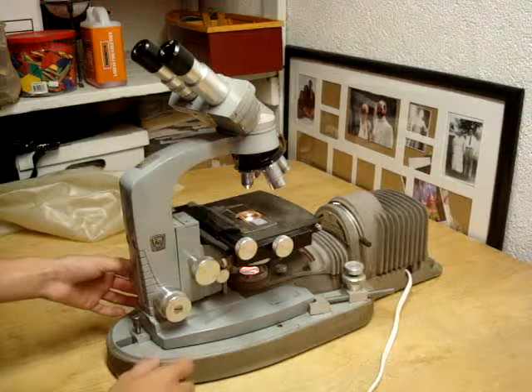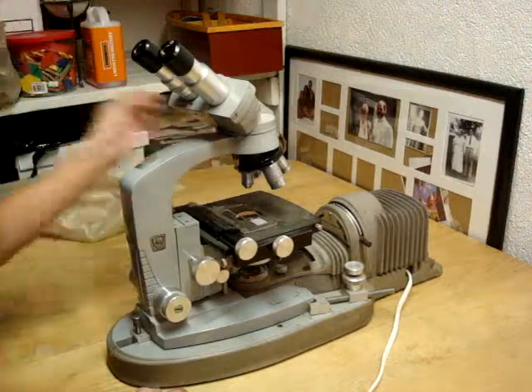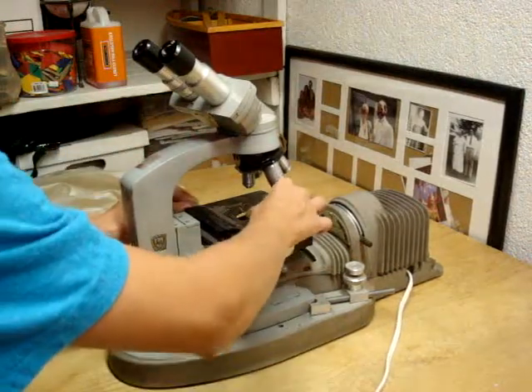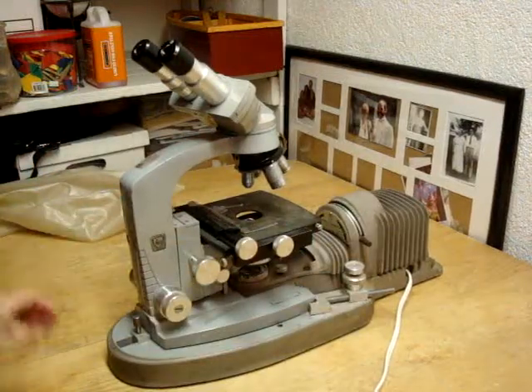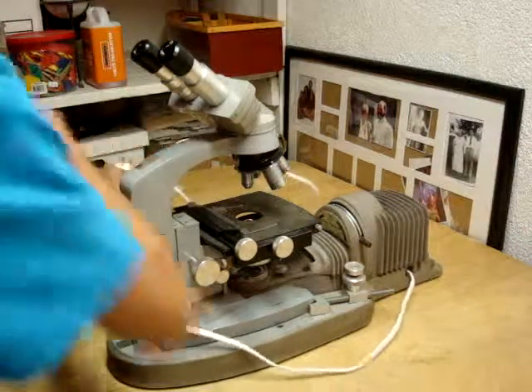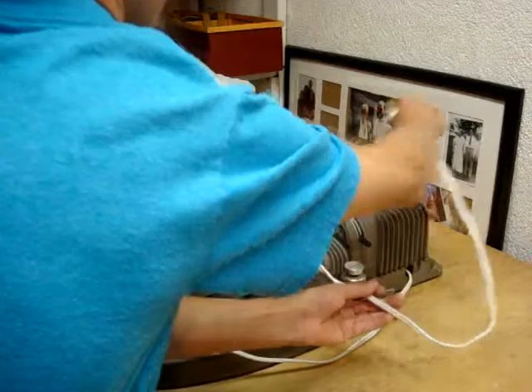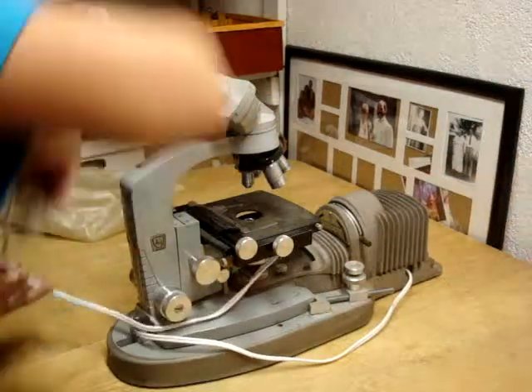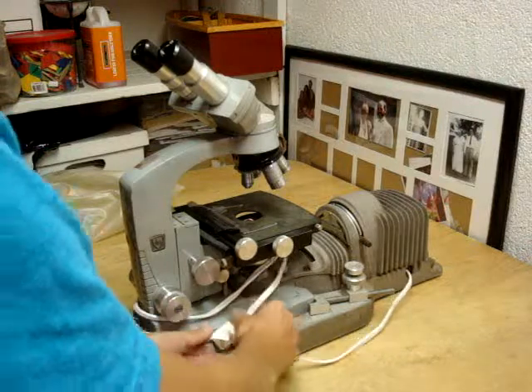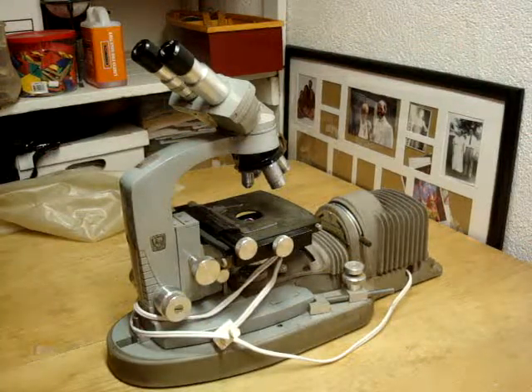Then you can turn it off and unplug it, or take the slide off first and then unplug it, and wrap the cord loosely around just like this.